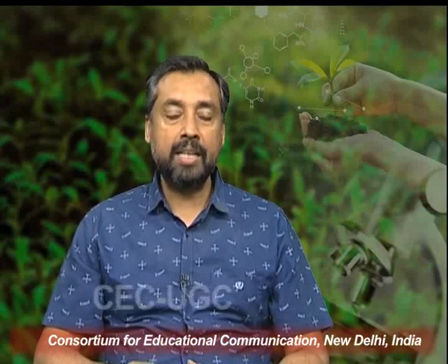These types of microscopes are very useful for micro manipulations and dissections also, where the ability of a wide field of view and the ability to zoom in and zoom out in magnification is very significant.